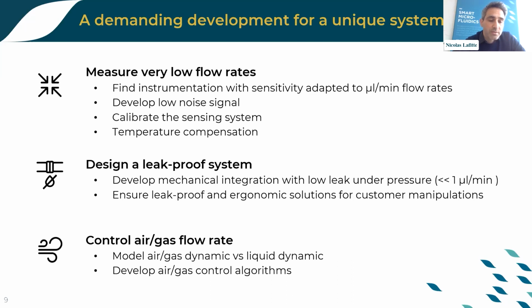Air is another fluid that is compressible, for example, and much more prone to pressure variation. So we had to model the sensor, the pressure controller of Fluigent, and the reservoir. We had to understand and model these parameters and compare them in order to deduce the liquid dynamic.